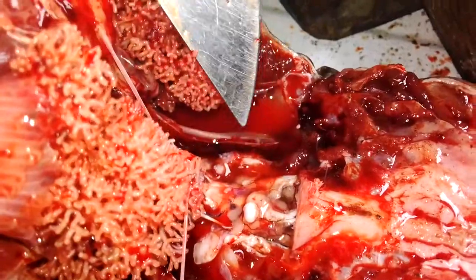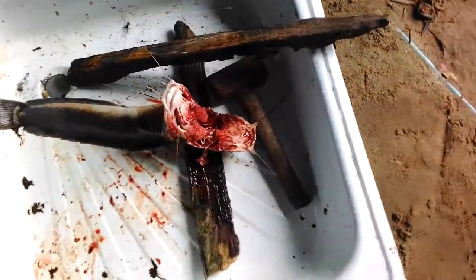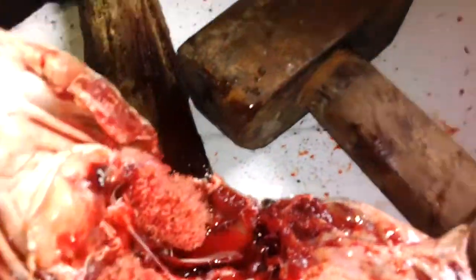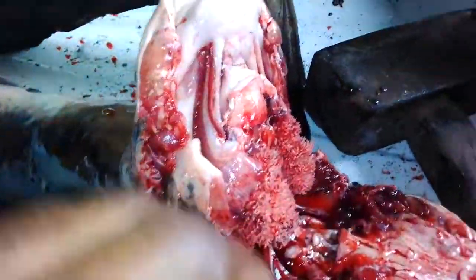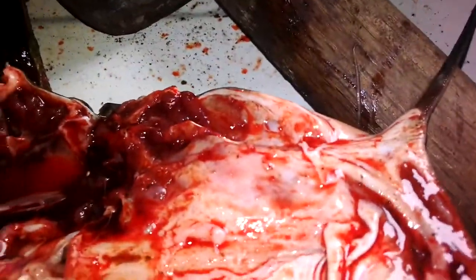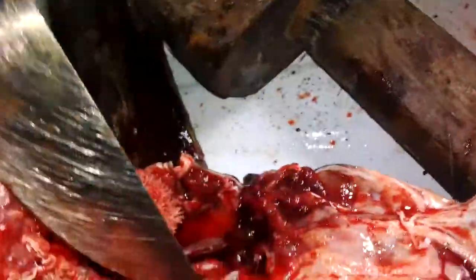The pituitary is sitting on top of the broken skull. When you open the fish up and break the mouth of the fish, the first thing you do is break the skull. You cut the skull out like this, and somewhere right there is the pituitary gland. I'm going to extract it and put it in a spirit bottle.